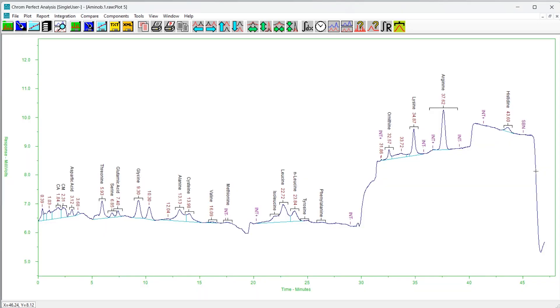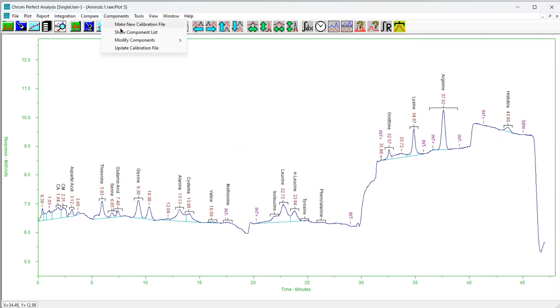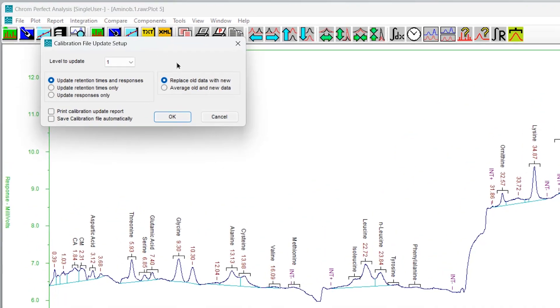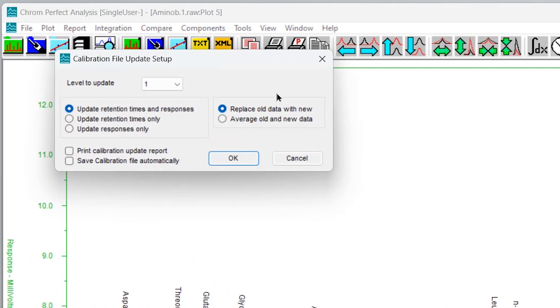Now let's get started updating the calibration file. It is possible to load a raw file, adjust the integration, and update the calibration file. This is much faster than the usual procedure which requires the creation and processing of a bound file. To update the calibration file, choose Components, then Update Calibration File. The following form will appear.